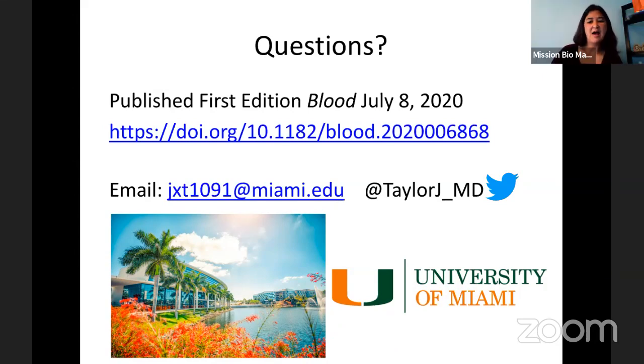A follow-up there, how many genes did you cover with your DNA panel? We had 17 genes, and so those were the 4 splicing factor genes, and we actually had multiple amplicons for those. And then in terms of other genes, they were selected based on the patients that we were sequencing. So we knew the bulk sequencing data for the patients, so we knew which mutations were present already. And then we were able to design the panel based on those genes. Great.